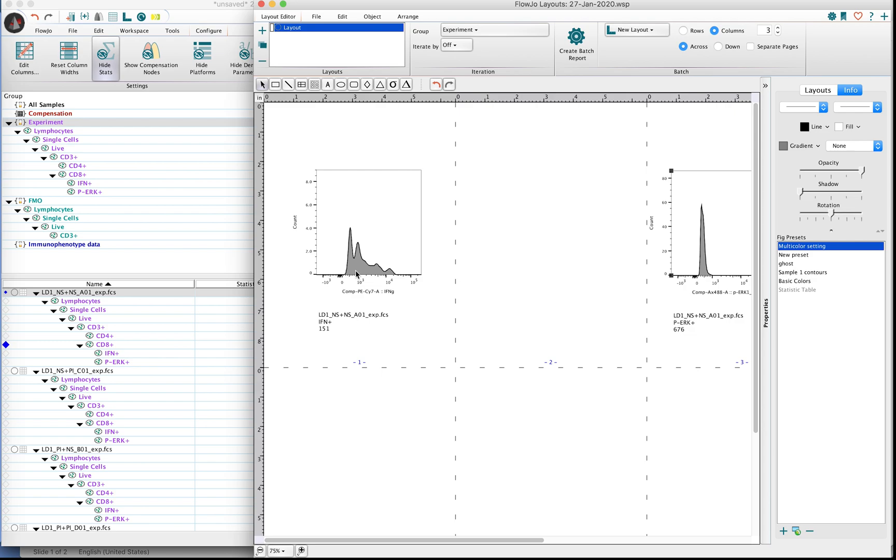I'm going to move this plot off towards the right. We'll start with the initial plot here, which is looking at some cells that are expressing interferon gamma.